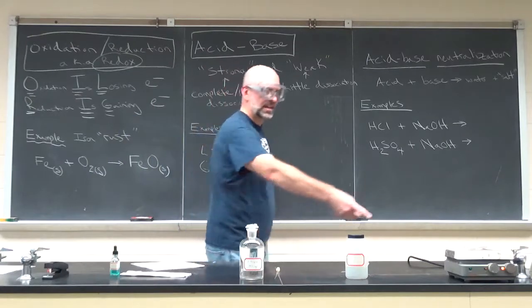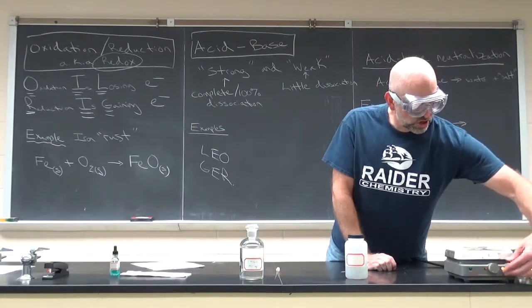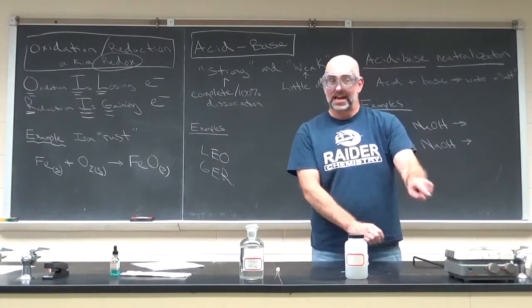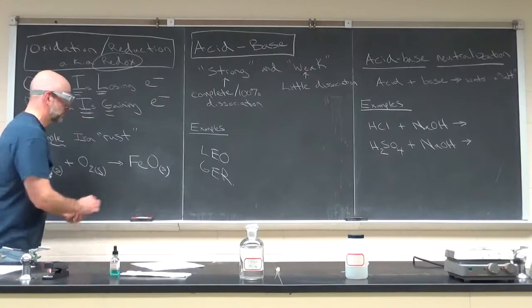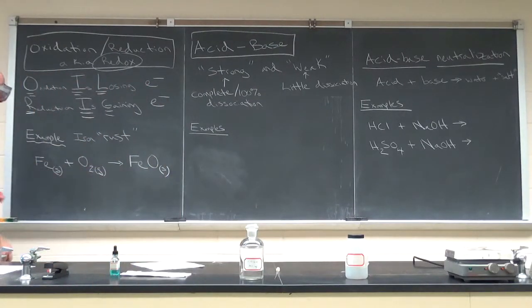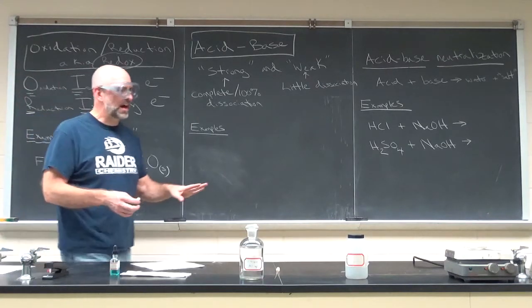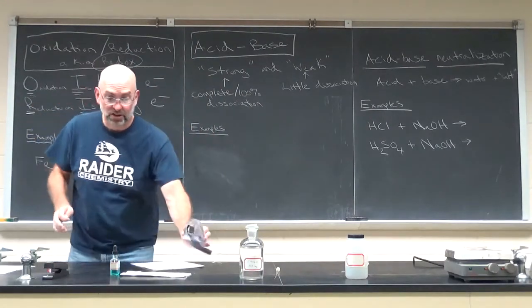And actually I see our little reaction over here is done, so I'm going to turn off the heat. And I'm going to come back to that. It's already finished. So use whatever mnemonic device makes sense to you, OIL RIG or LEOGER. And I'm going to use two examples, one not from the lab and one from the lab in a different format. Okay, so actually I think we're safe now that the heat is off there. Good, I can take these off.